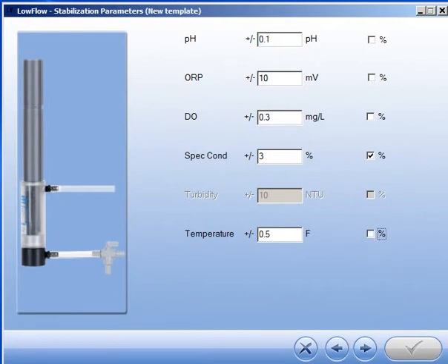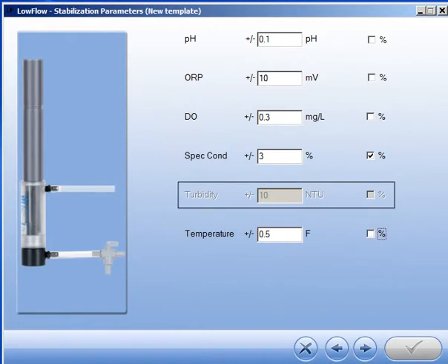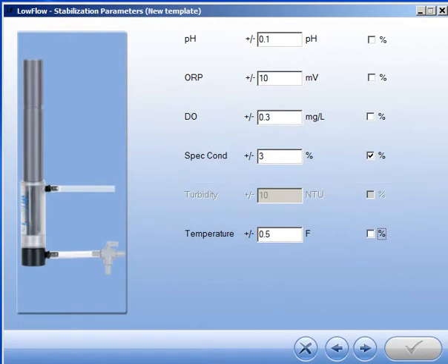Note that you can't change the turbidity values in this screen. That's because we didn't enter information about an external turbidity sensor earlier. You can always go back and change that if you want.